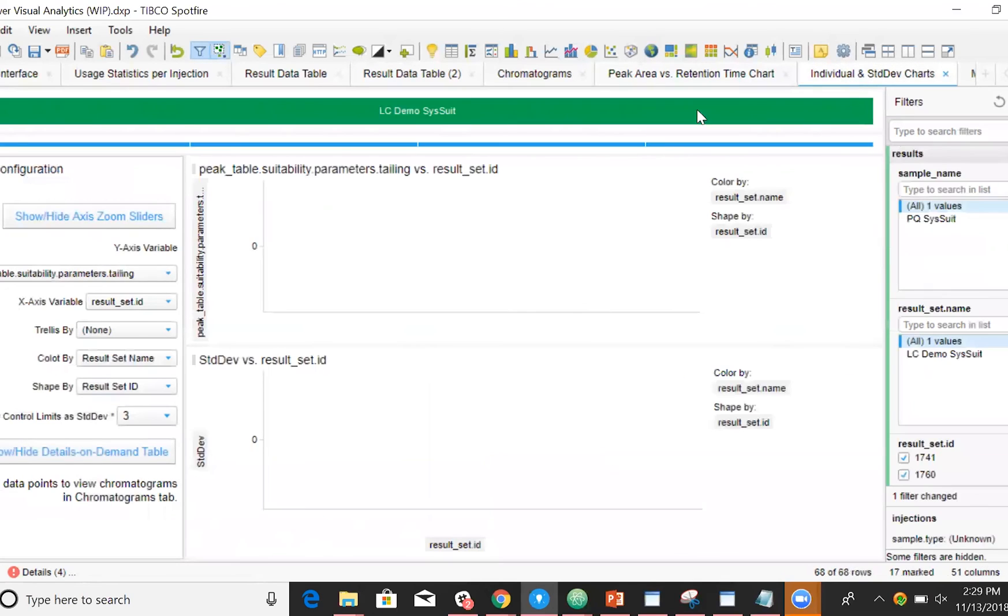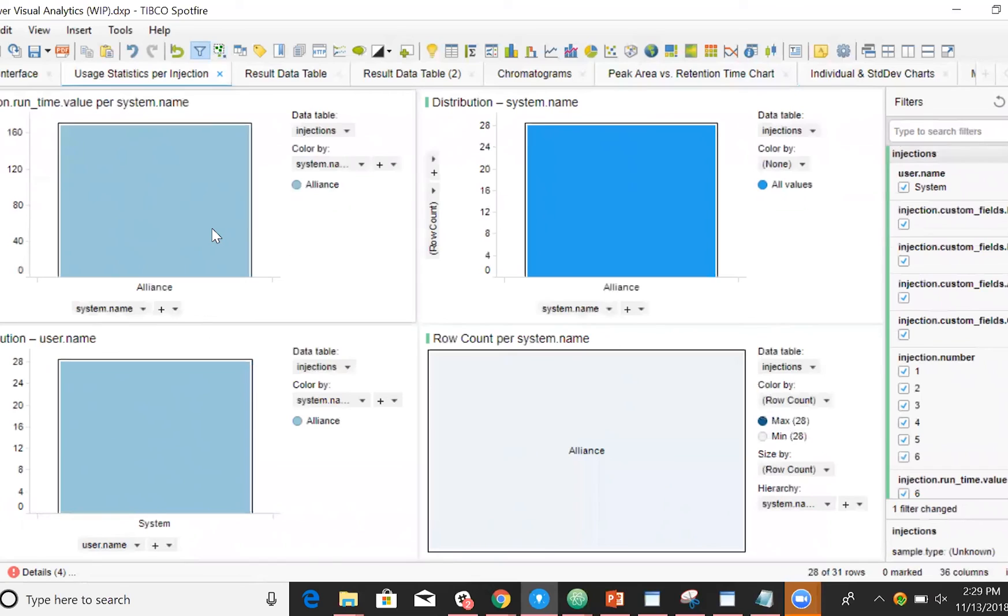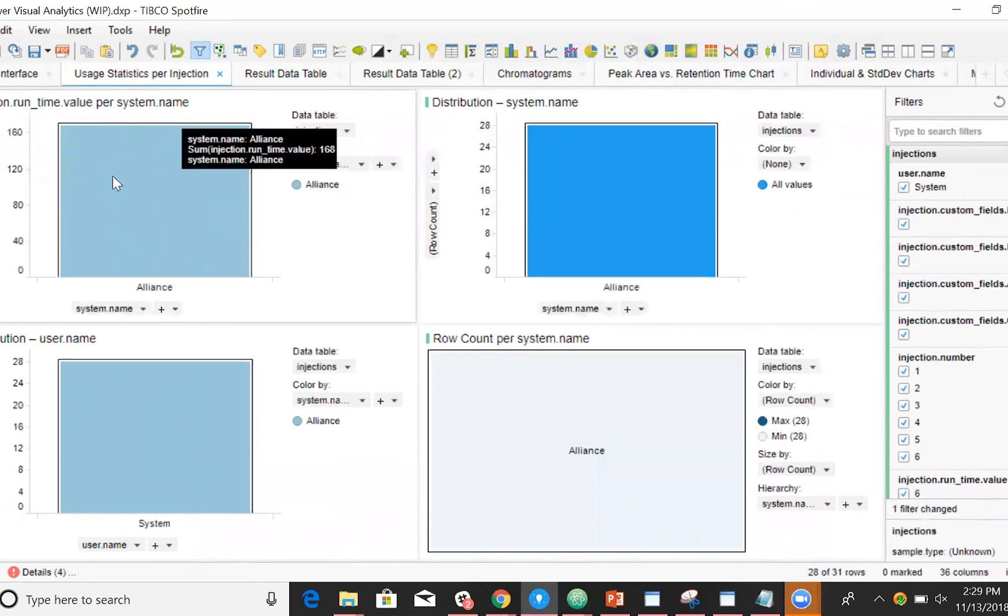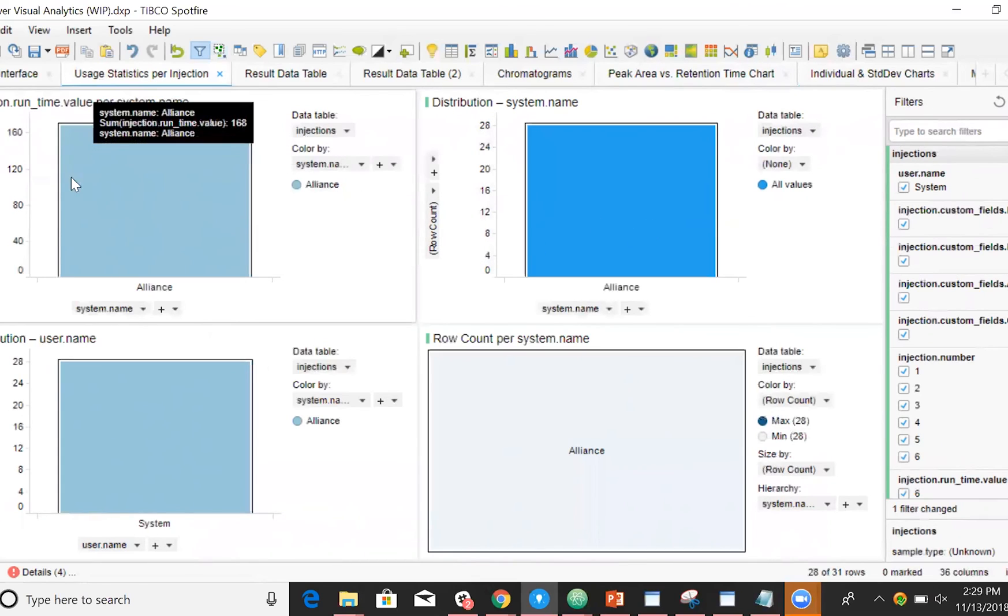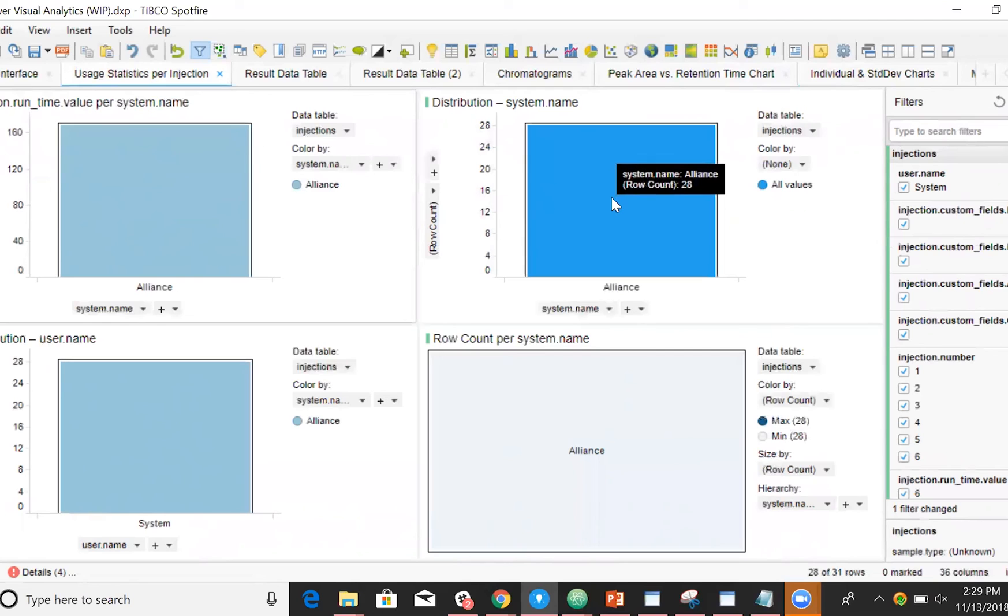In addition, we can build more complex visual analyses, as well as system statistics and usage. For instance, how many injections have been run on the system? How long have the runs lasted? What user has been doing the injections?